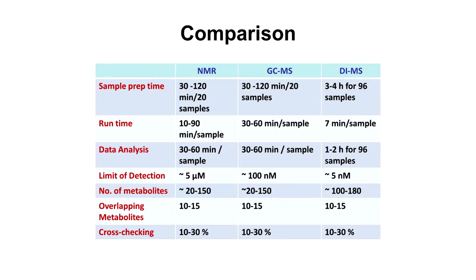Now, what you can see from here is that many of these things take a long time. It's not seconds, it's not even minutes, it's hours for each sample to be analyzed and characterized. And even for NMR or for LCMS, they still take a fair bit of time each. Automation is typically greater for LCMS thanks to the huge efforts going into proteomics, where automation has been driving a lot of activities. But we'll talk about some of these new technologies later on about how this is also enhancing runtime and automation elsewhere.